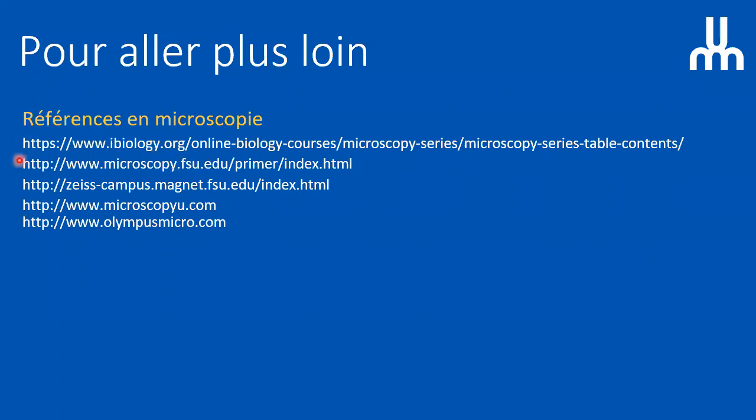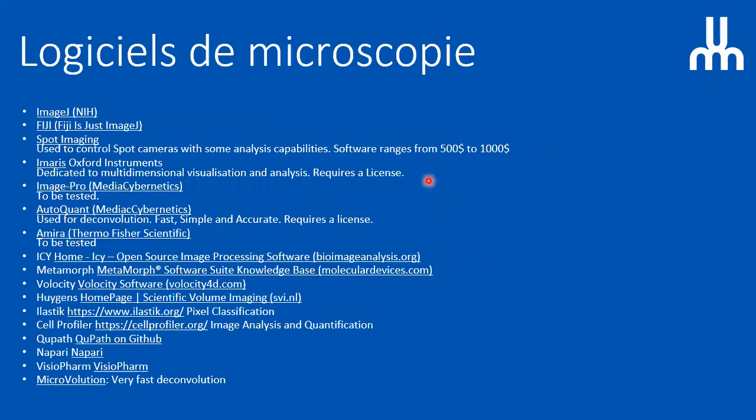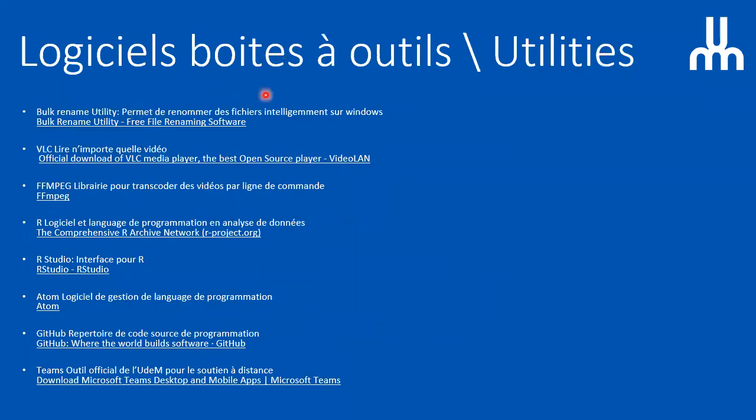There are other resources available here, but these are not videos. I put the links of all the software that I know and that might be useful in microscopy here, with the link directly to the website where to download them. I also put a software utility box, software that you might know of or not, but that I found useful in the microscopy world. Most of them are freely available.